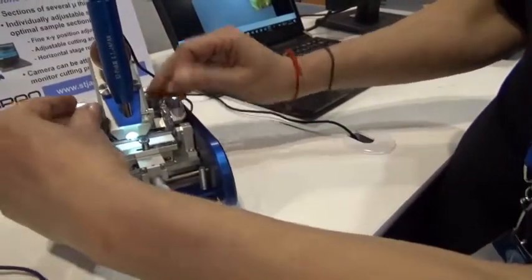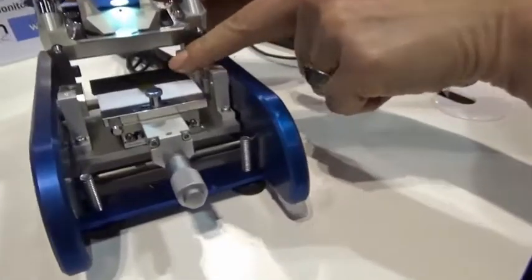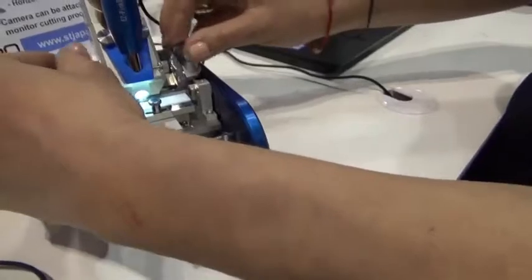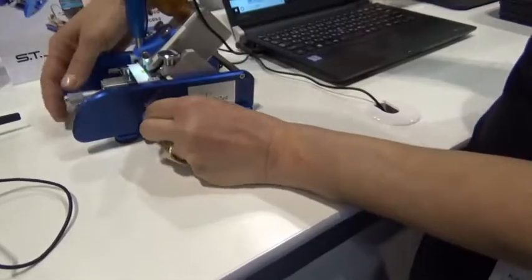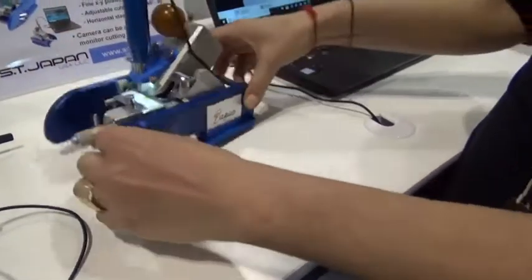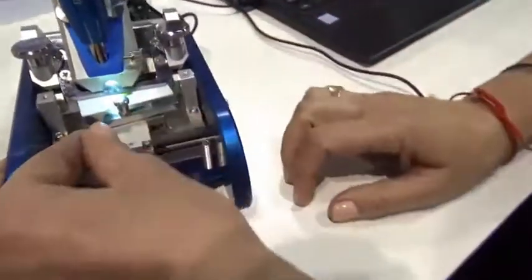You open the sample compartment, you can fix your sample here with the magnet, you can adjust the cutting angle between 45 and 90 degrees, and you also can rotate the stage up to 10 degrees.